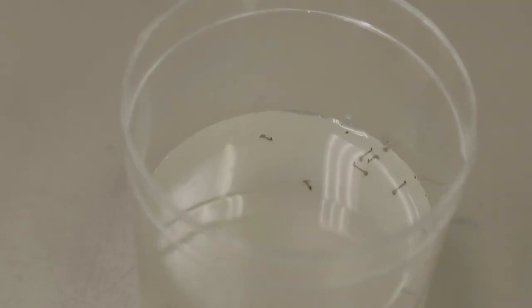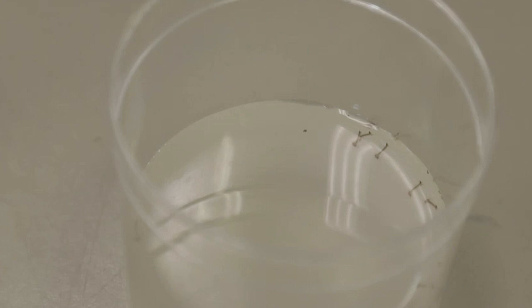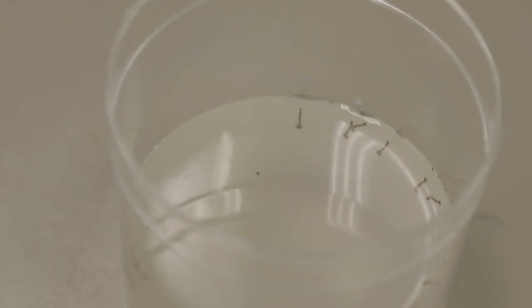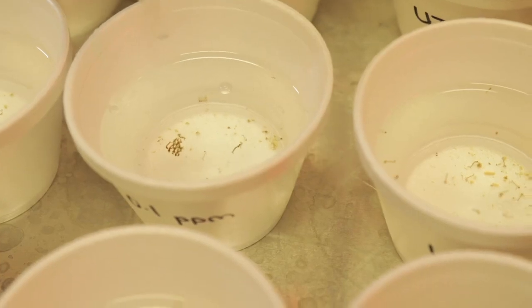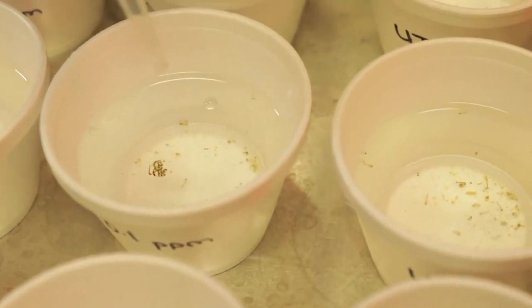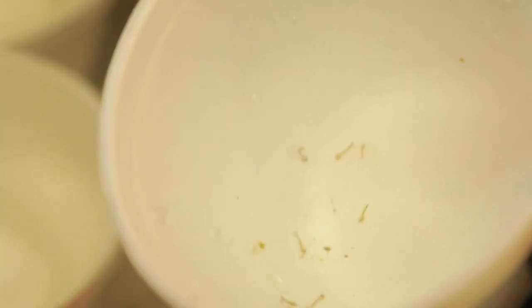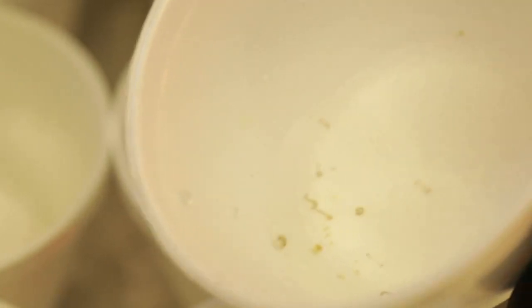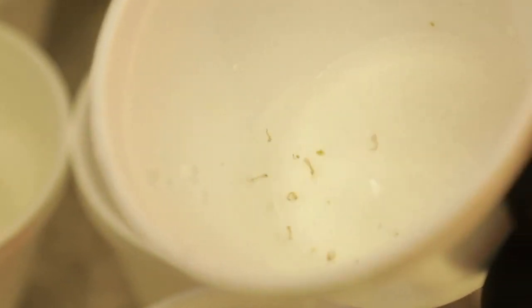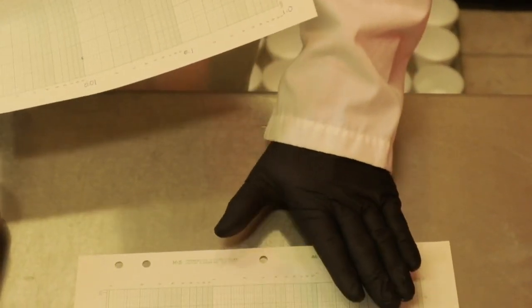Moribund larvae are ones that cannot maintain normal position, do not show the characteristic diving reaction when the water is disturbed, and often exhibit a shrunken body and dark coloration. If the larva does not move when touched with a dissection probe or some comparable item at the siphon or cervical region, then consider the larvae to be dead. It can be risky to count cadavers, as dead larvae can be consumed by survivors during the test period. You want to record the number of surviving mosquito larvae on a data sheet.